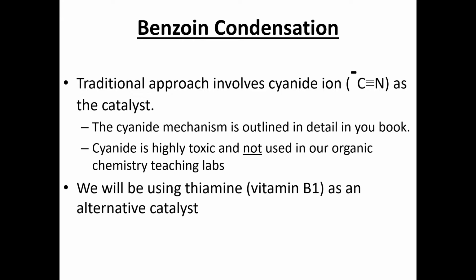And just to be safe with the students, we always try to find safer alternatives to use in the lab to perform these similar reactions. So if you want to learn how the reaction is done with cyanide, you can look at it in your lab manual. But for this case, how I'm going to teach it, we'll be using thiamine or vitamin B1 as our catalyst.